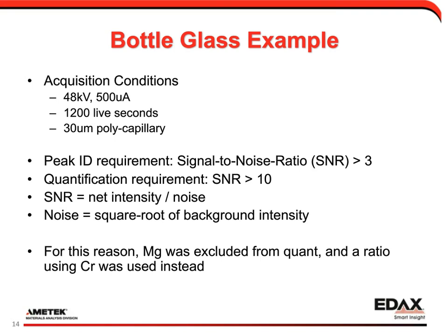So after running the auto run, which collected all the raw data from all of the glass samples, we then have to identify the elements of interest, and then one step further, determine which of those elements we would want to use for quantification. That also is defined in the method. For elements to be labeled in the spectrum, they must have a signal-to-noise ratio in excess of 3.